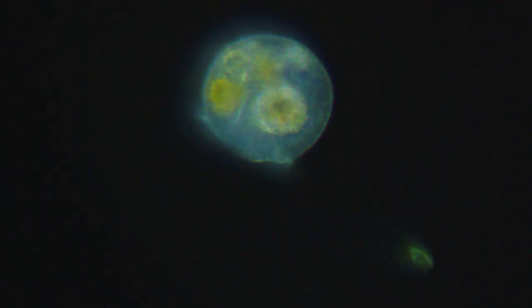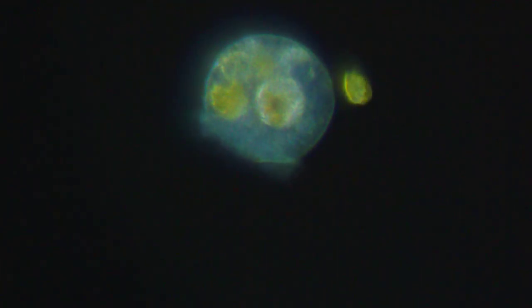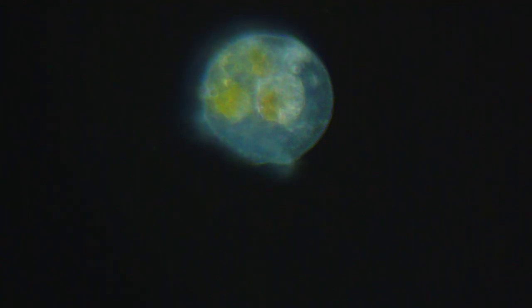Now I'm adjusting the focus so we can see the little cilia, maybe. You can see all the little parts of him, parts of this single-celled animal. It's tough when you're at this magnification to get clear images, because the depth of field is so narrow. It's just a narrow little slice. So I'm backing out on the focus. He goes out. Go back in. About there. That's about right.